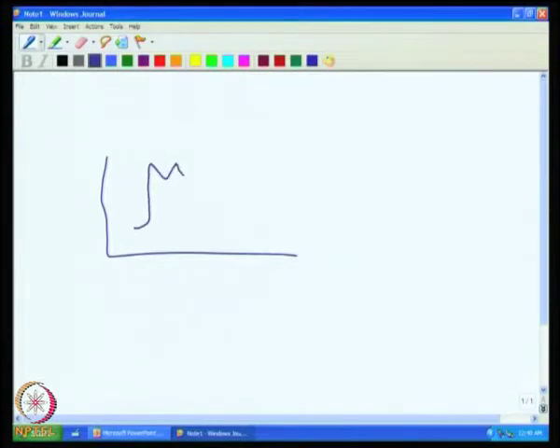So, you would see that such a system would give you fairly good reproducible results, and it has been observed sometimes that double peaks appear for a number of volatile elements like zinc and lead. Whenever you use antimony, you would see two peaks, for example, something like this. You would see a curve like this. This is for absorbance versus time signal. This is for antimony.